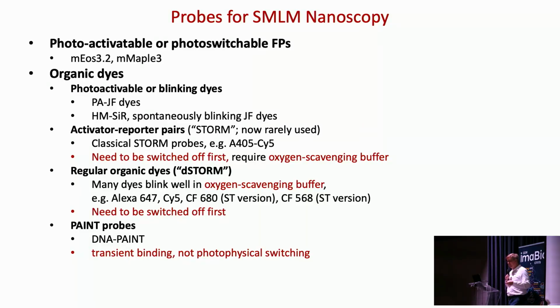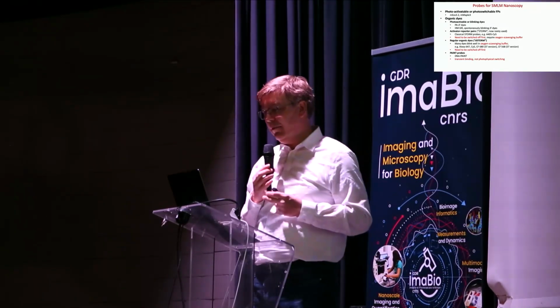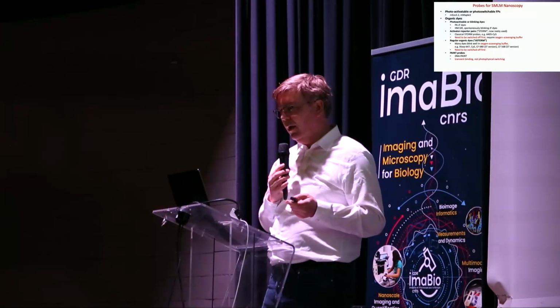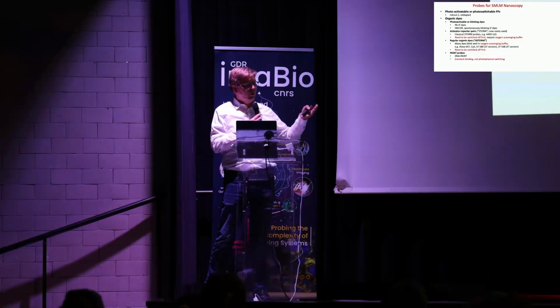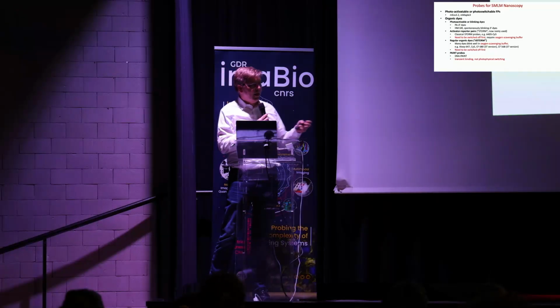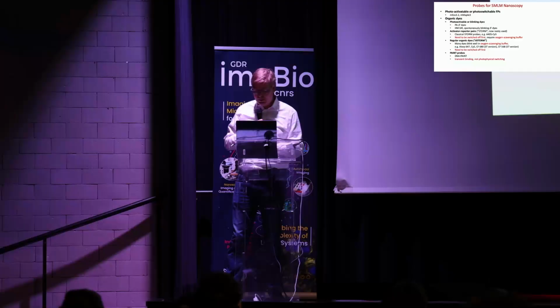And then the PAINT probes came up. Actually, it already started in 2006, but I think the real breakthrough as a generally usable tool came with the DNA-PAINT development. I'll talk more about DNA-PAINT towards the end of my talk. What's important to note is that all these rely on some photo-switching or photo-conversion concept where essentially light is turning molecules on and off, while the PAINT probes rely on a transient binding effect to get the switching effect. So it's a very different switching concept.